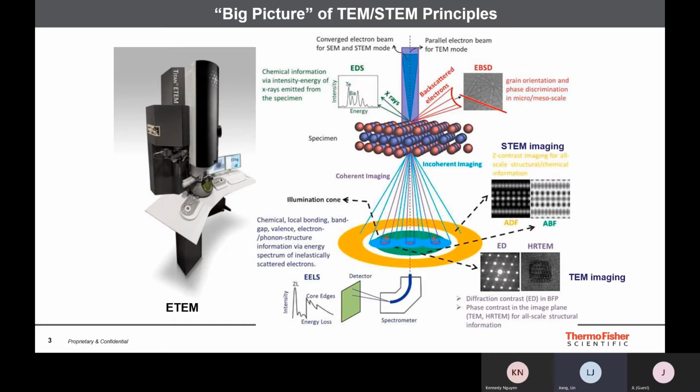Of course, that's another thing we need to notice. For the EDS signal, we capture the EDS signal above the sample, because the electron beam is going to interact with the sample and generate X-rays, and the X-rays are going to emit in many directions above the sample. So we need a detector above the sample to collect this fingerprint elemental information.